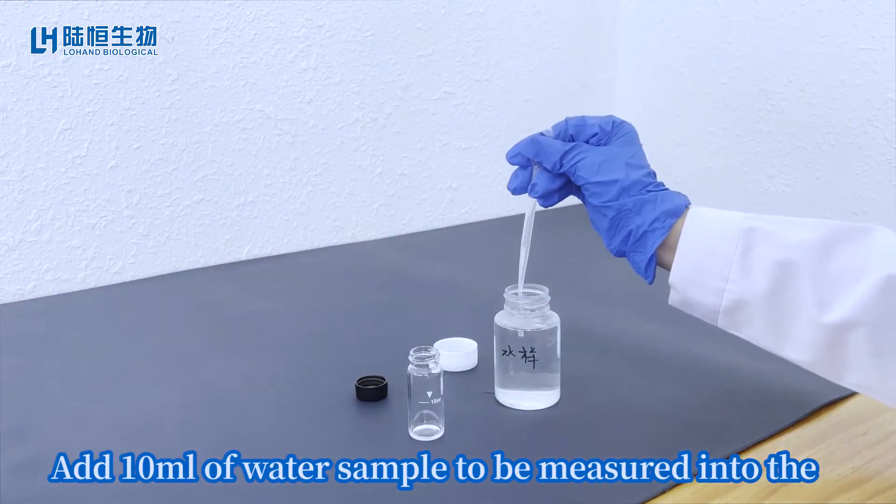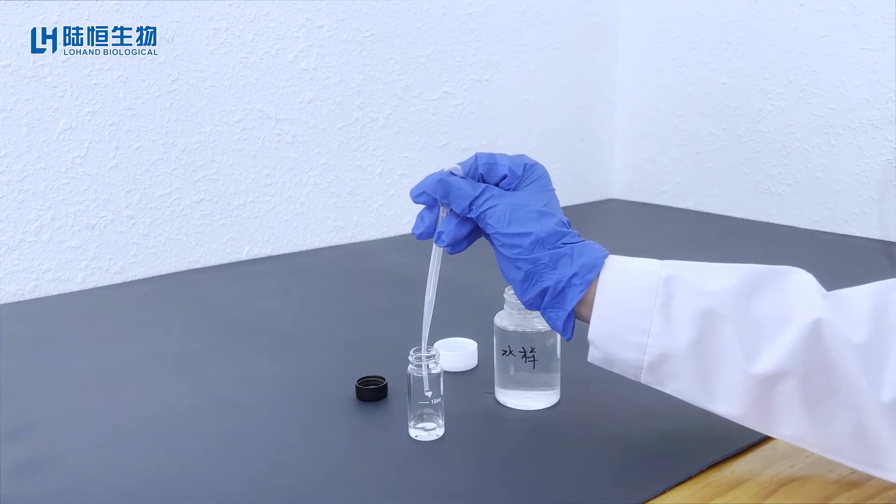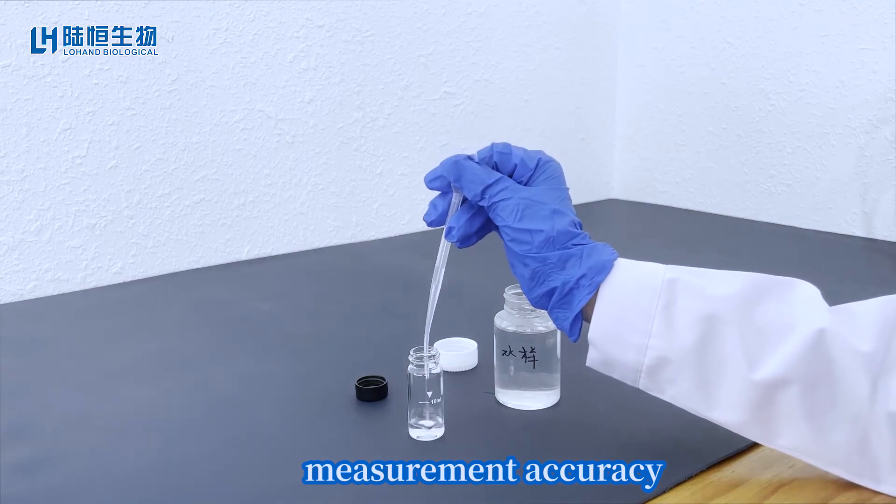Add 10 ml of water sample to be measured into the colorimetric bottle. Note: add slowly to avoid bubbles affecting the measurement accuracy.